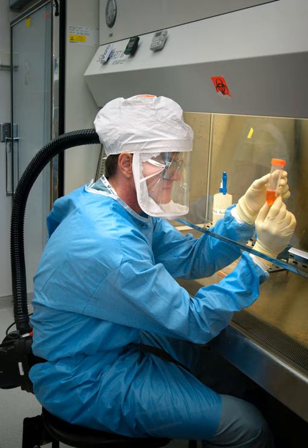Type B1 and B2 cabinets have a minimum inflow velocity of 100 feet per minute, and these cabinets must be hard ducted to an exhaust system rather than exhausted through a thimble connection. Their exhaust systems must also be dedicated, 1 BSC per duct run, per blower. In contrast to the Type A1 and A2 cabinets, Type B BSCs use single-pass airflow, air that does not mix and recirculate, in order to also control hazardous chemical vapors.